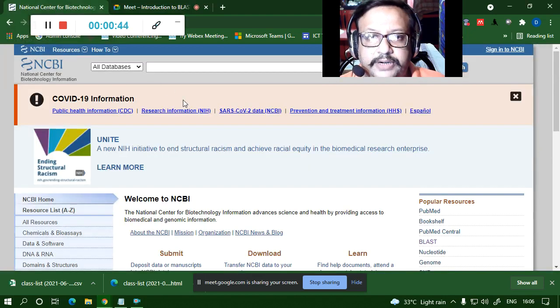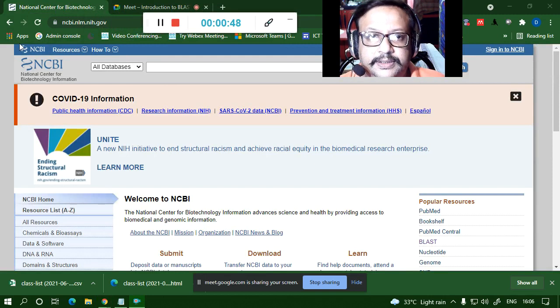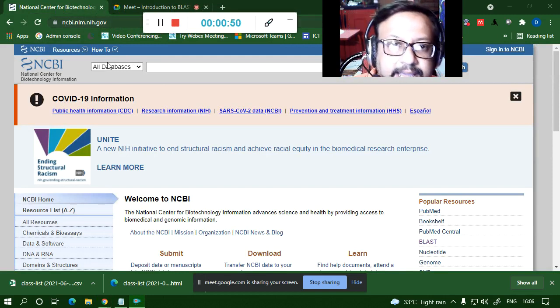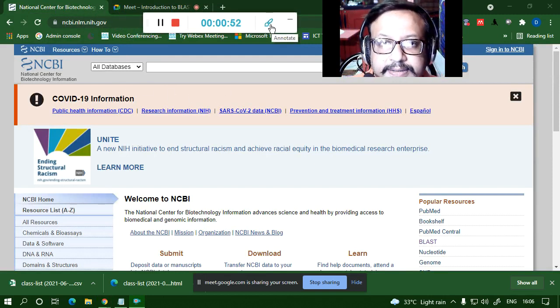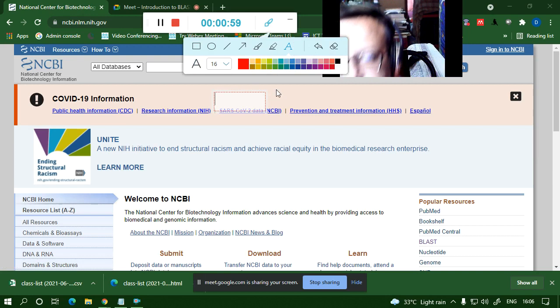So I had already opened up this particular site. The address is ncbi.nlm.nih.gov. I'm typing it over here.